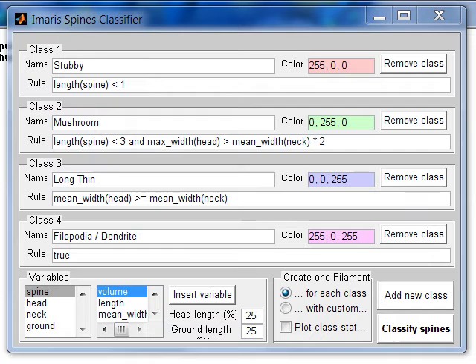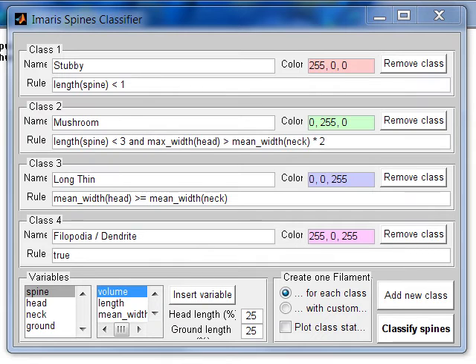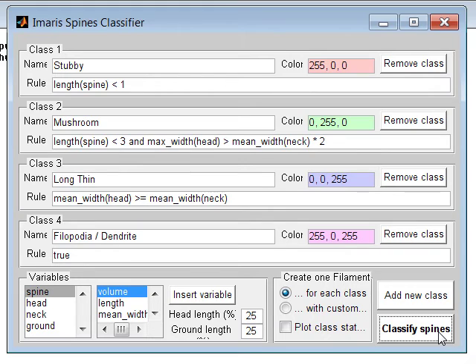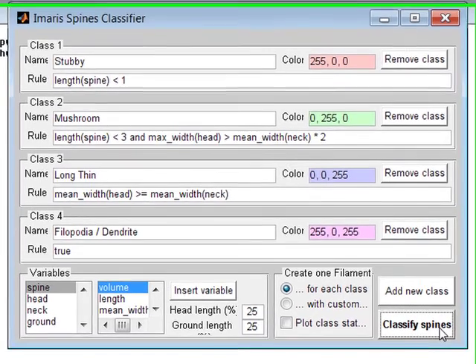For the remaining spines, the first classification rule is false and the process of classification continues by applying the second rule. Select the button classify spines to execute this extension.